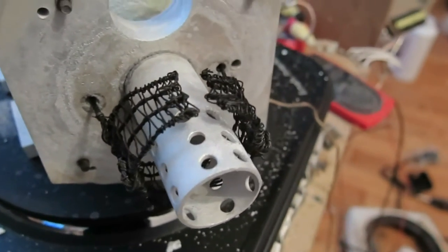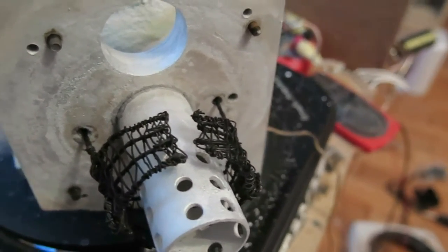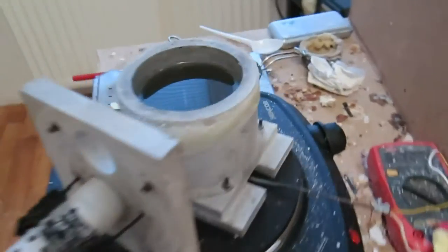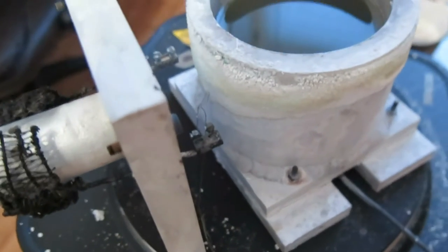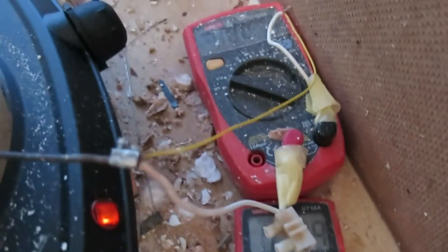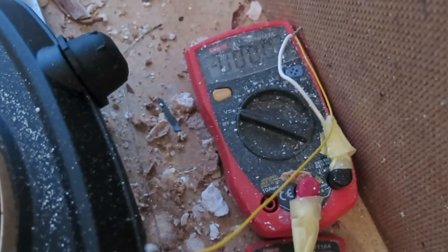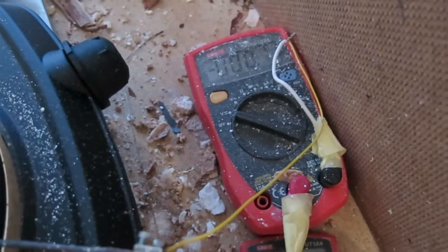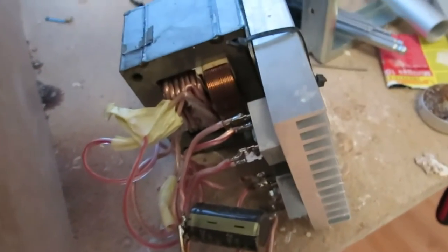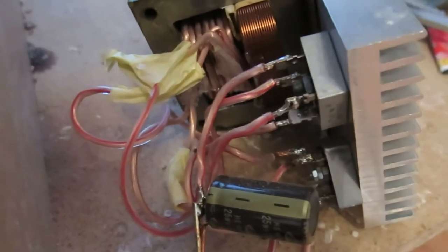A hole in the lid is used as an oxygen exhaust. Bolts are used as a position guide. A temperature probe is fixed in the cell body to measure salt temperature. A small resistance wire is used to measure electrolysis current. As a power source I use a modified microwave oven transformer with output of about 8 volts and 40 amps.